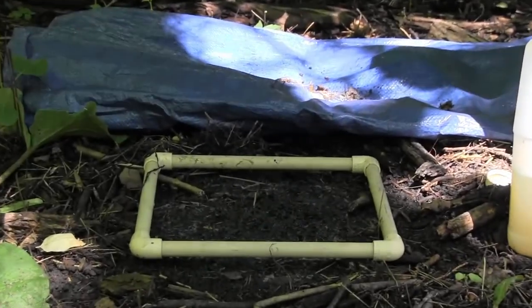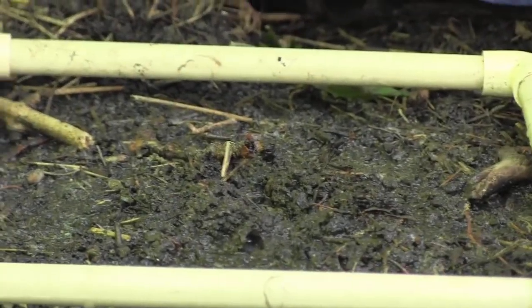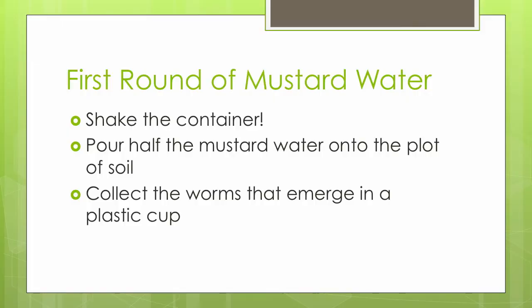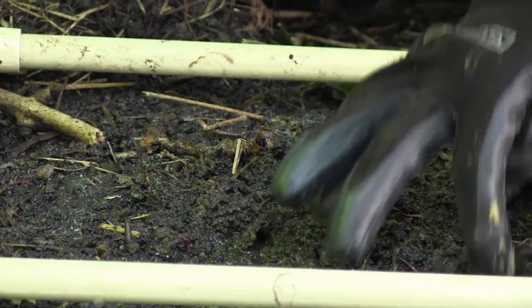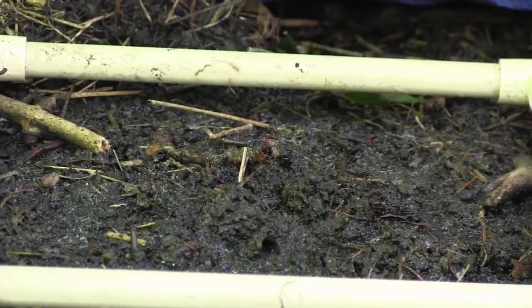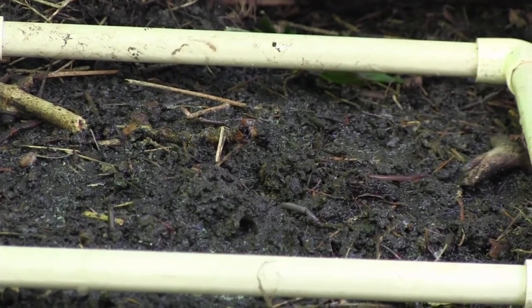Then normally I have to wait 5 minutes to see if any earthworms come out of the soil. Okay, there's a little one coming out right now.